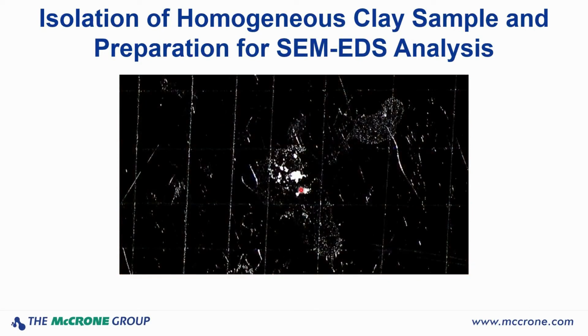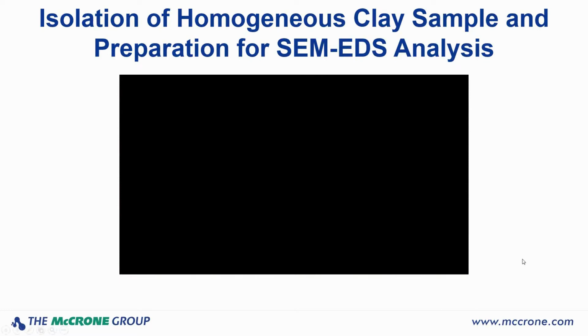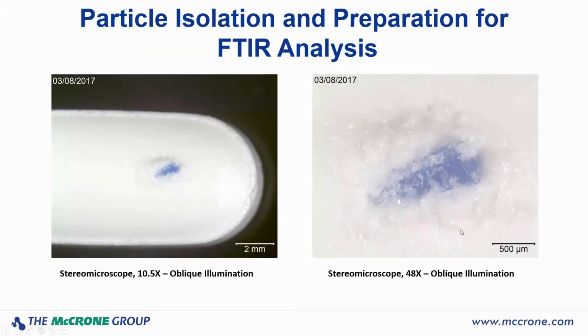And that's your sample prepped. There's your sample prepped in oblique illumination. So that's ready for EDS. Let's make one for FTIR now.